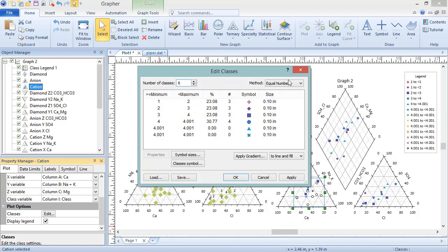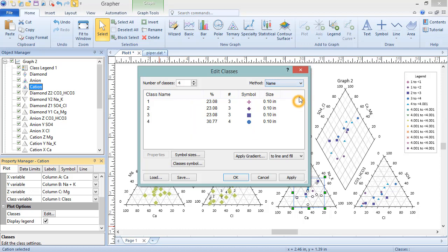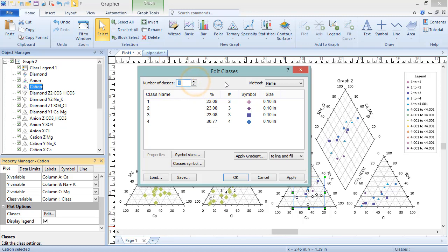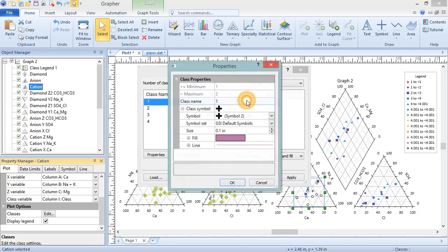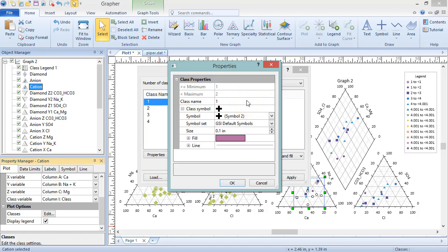When the method is name, the number of classes will automatically update to the number of unique entries in the class column. But classes can still be added or subtracted by increasing or decreasing the number of classes. Below these fields are the classes themselves. Double-click on any entry in a particular row to edit the class name and or symbol properties for just that class.